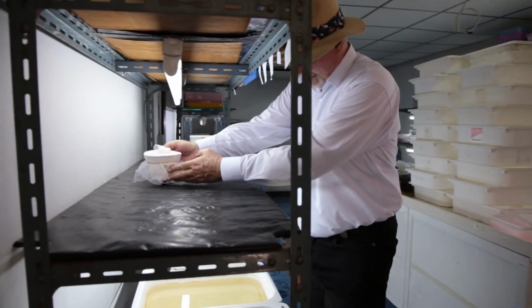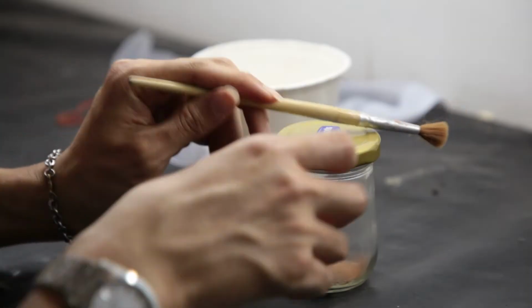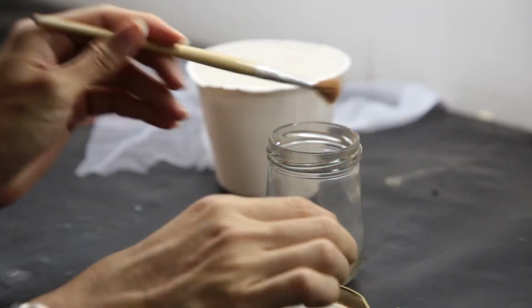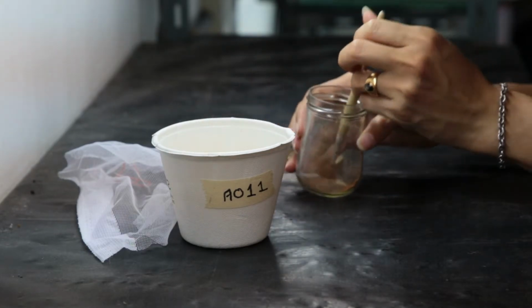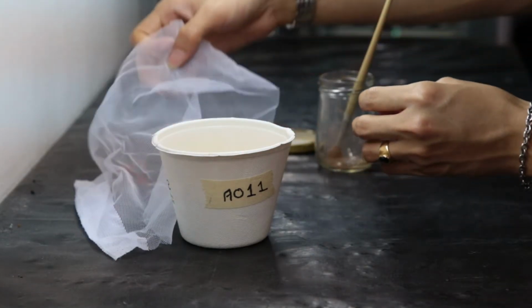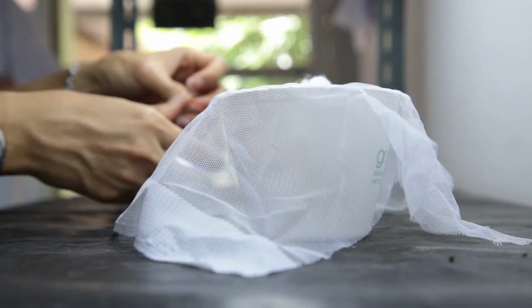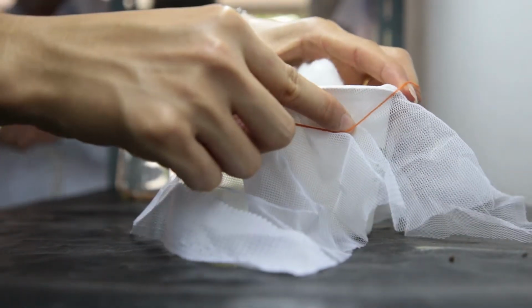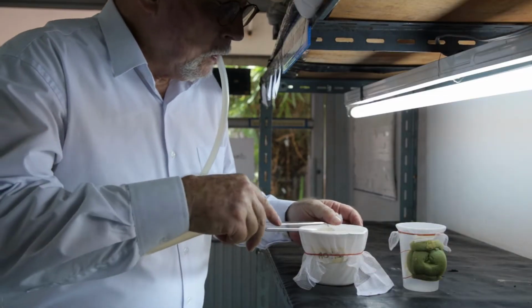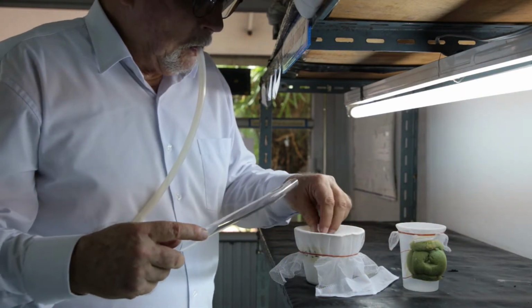Ideally inside the insectary at about 25 degrees centigrade. Feed the larvae with powdered fish flakes or other prepared larval food as explained in the tutorial on insectary management. Because the container is small, you need only put in a small amount of food once a day. When an adult mosquito emerges, you can remove it with an aspirator.